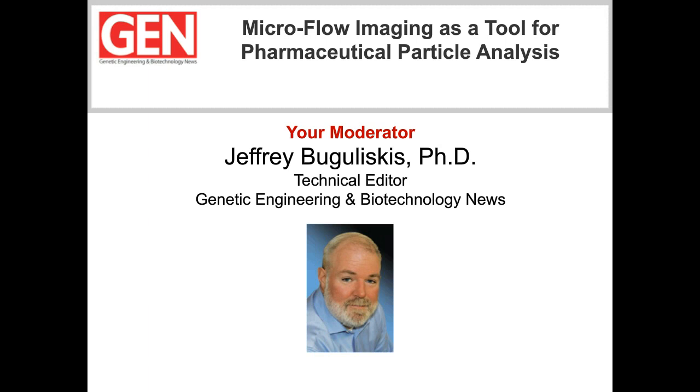Current methods for characterizing PLGA, or polylactic coglycolic acid, microparticle size provide limited quantitative information and often overestimate size due to the presence of clustered particles. Since the size of PLGA microparticles is of critical importance for polymer degradation and drug release rates, investigators are continually searching for techniques that provide rapid and accurate particle size measurements.